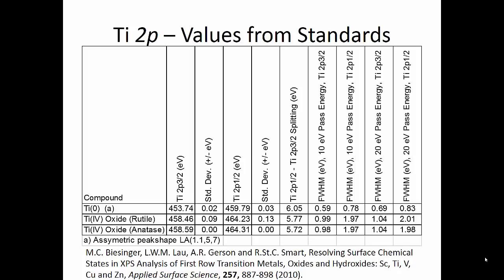From standard spectra we find that the titanium metal peak shape is defined by this function here in CasaXPS called the LA function. We've been using that to good use. Some other things that we need to know is the splitting between the 1/2 and the 3/2 peaks, and for the metal it's 6.05 eV.